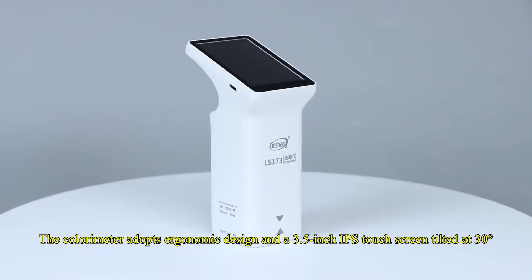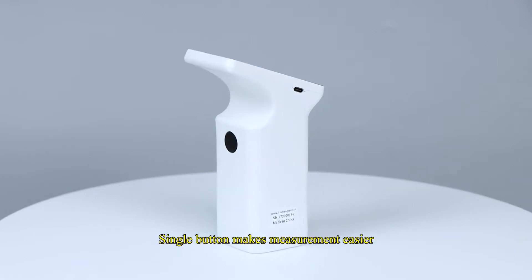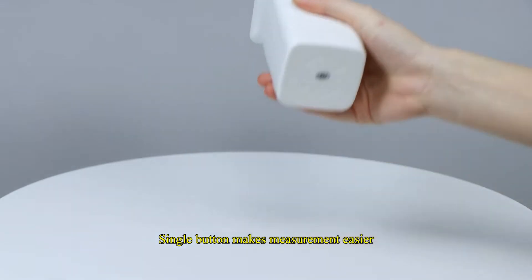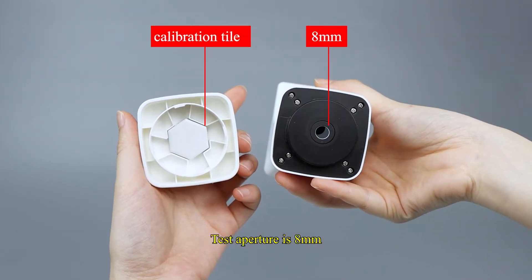The colorimeter adopts ergonomic design and a 3.5-inch IPS touchscreen tilted at 30 degrees. Single button makes measurement easier. The bottom cover has a built-in white calibration tile. Test aperture is 8mm.